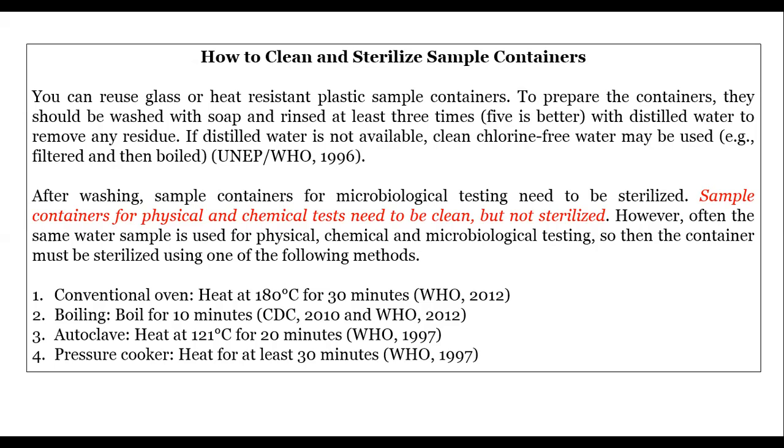And you also have boiling for 10 minutes in a pot. We call it a water bath. You can boil your sample container in it to kill all bacteria present in it for 10 minutes. The CDC report of 2010 and the WHO report of 2012 say this particular method works best.